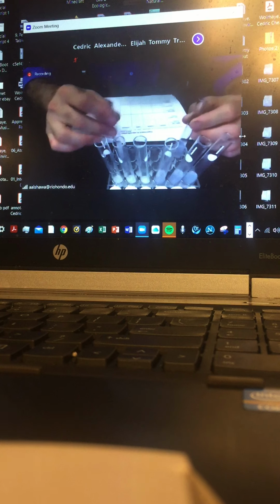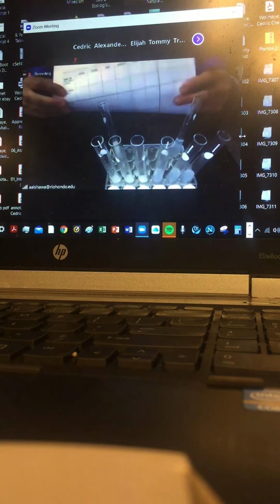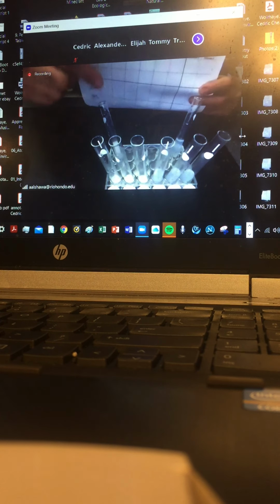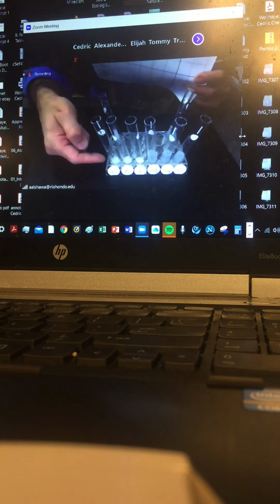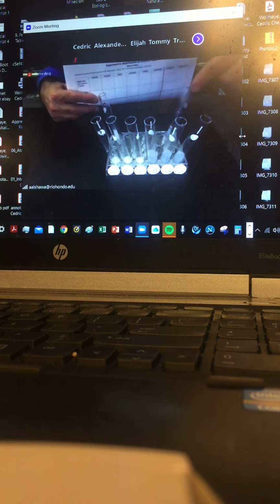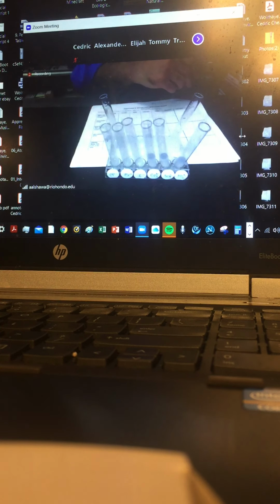Okay, so I'm going to follow up. So this is what concludes the first step. So where there's a solid line, that solid line means clean all these glassware, position them the way they are based on that matrix, based on the layout shown, and then add to them the same chemicals, the same anions. I'm going to replicate the same thing. But I have plenty of sets of those test tubes, so I'm going to put these on the side for a second.